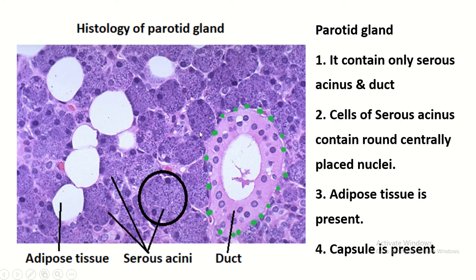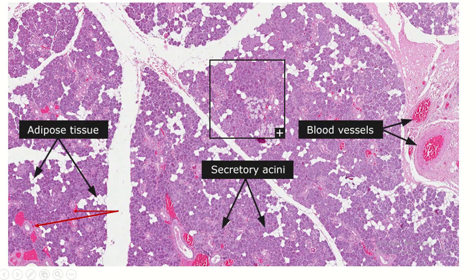The staining of the serous acini is more than the duct. The serous acini cell contains round nuclei. The parotid gland also contains some adipose cells — these are the adipose cells. The parotid gland is covered by a capsule.